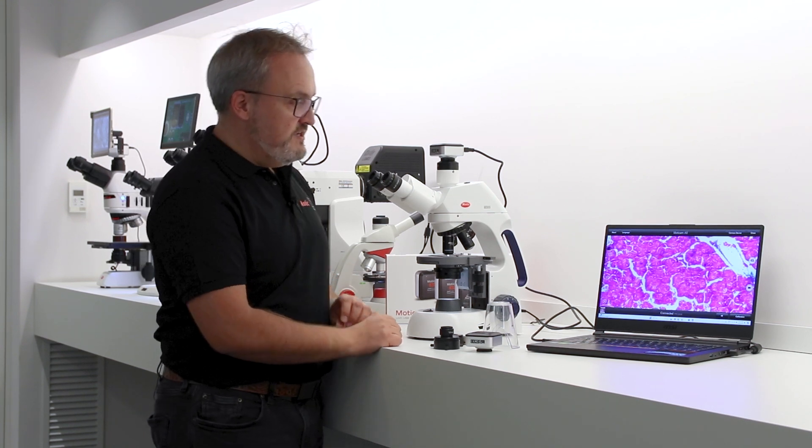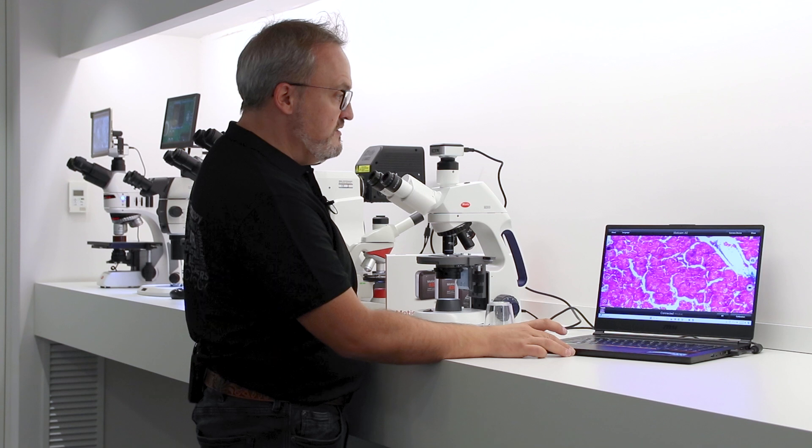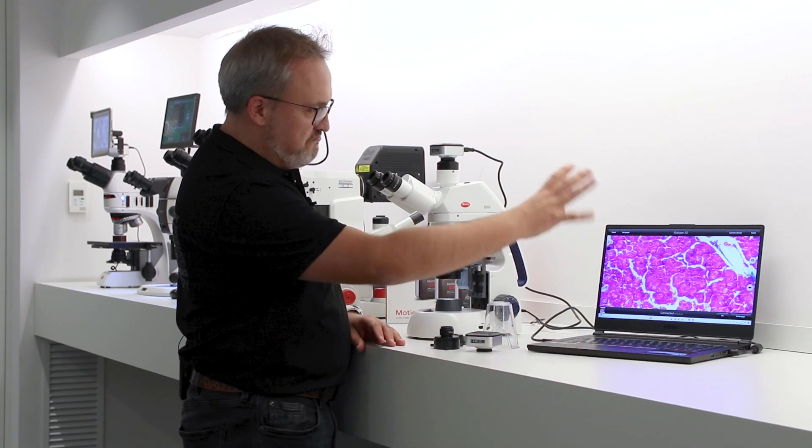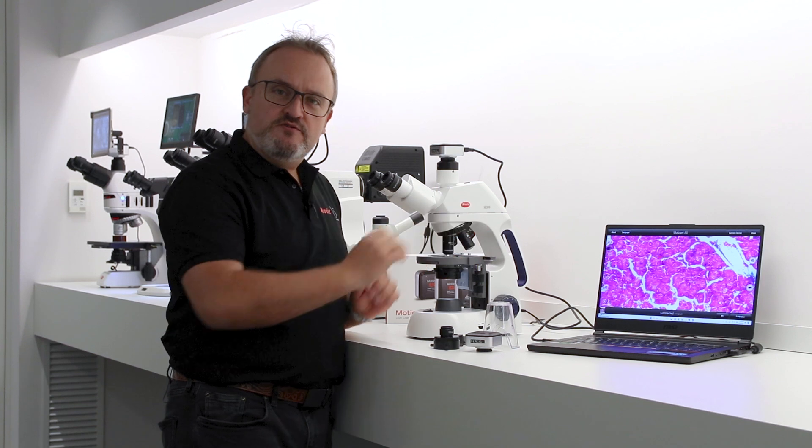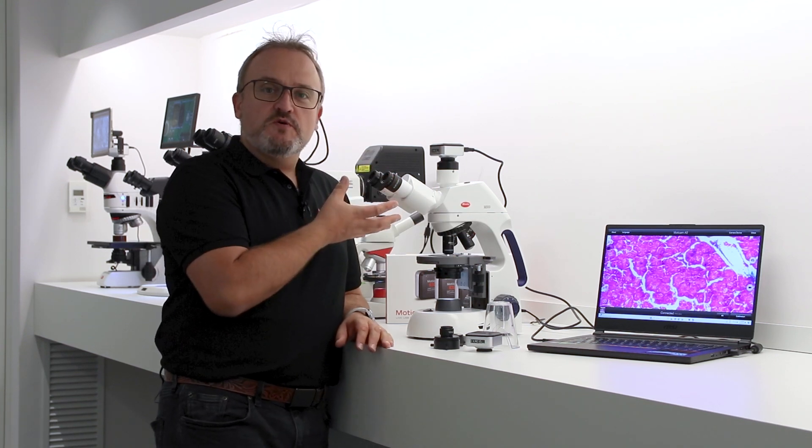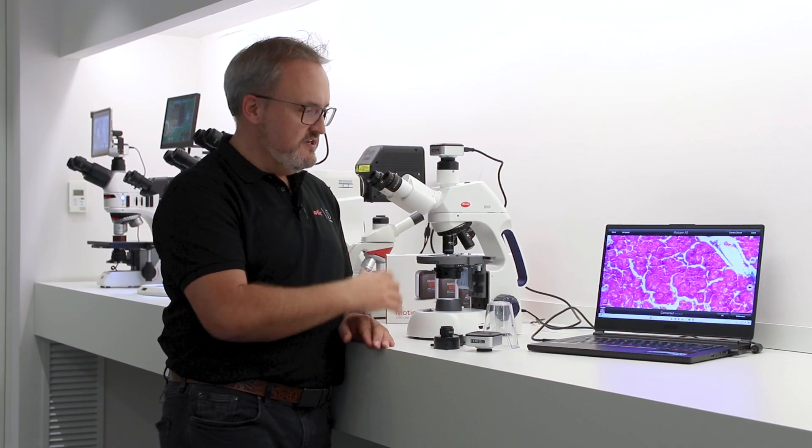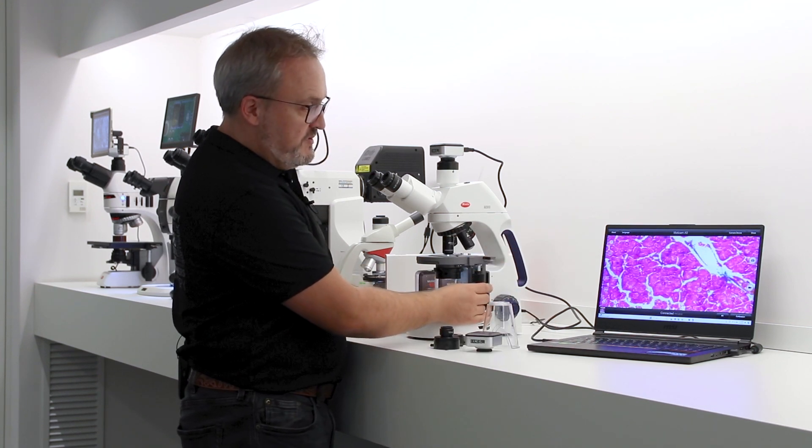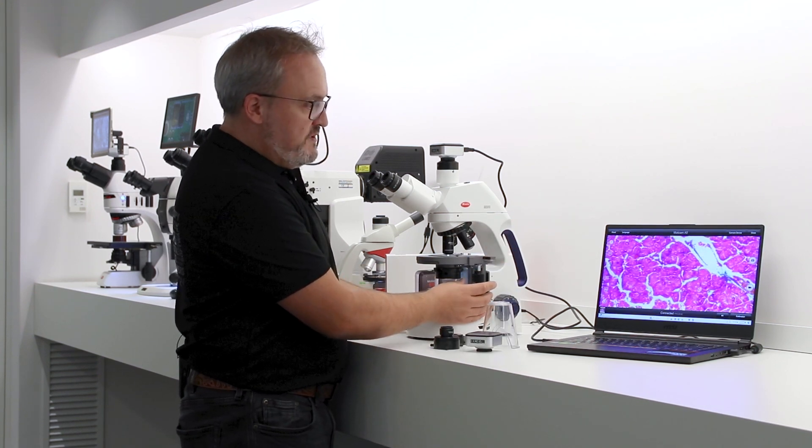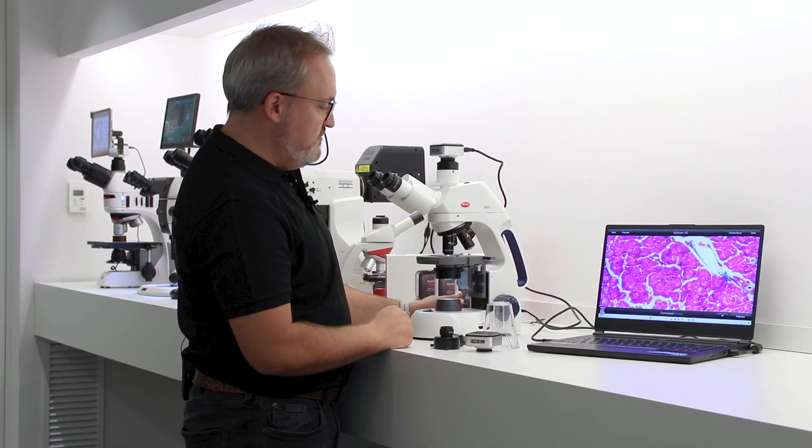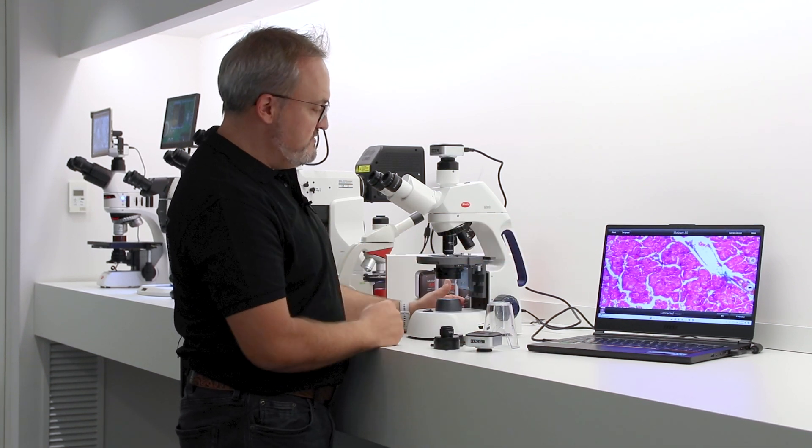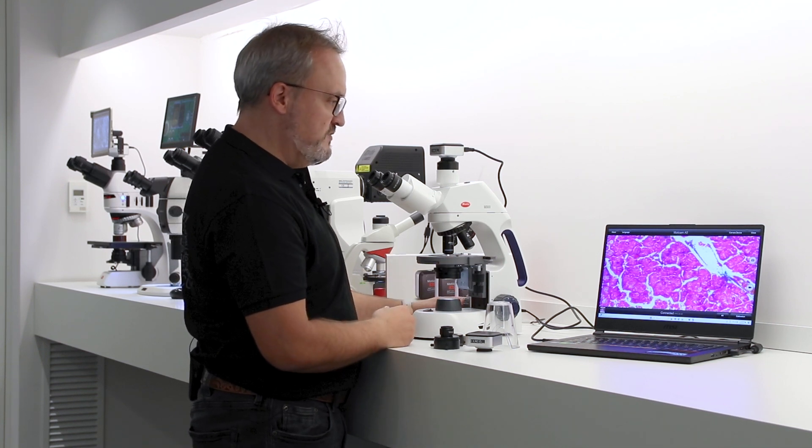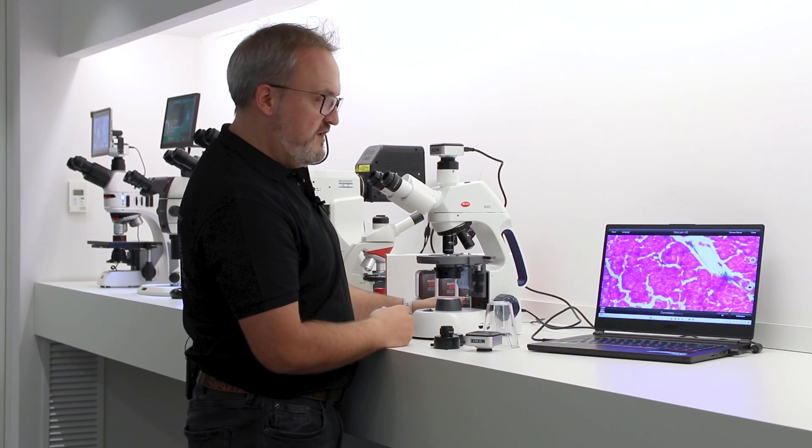What we can see here with the software is that you can share the image by having it on a bigger screen. If you're looking at a microscope, only the person looking through the eyepieces can see the image. Whereas if you have it live on a bigger screen, more people can stand around and virtually see what is down the eyepieces, so you can share the microscope between 5 to 6 users.